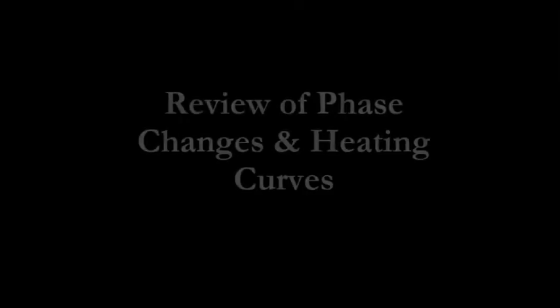We're going to look at phase changes with water once again, as we did with the heating curve of H2O lab last quarter. We looked at the range of phase changes and temperature changes that occur when you go from ice to water to steam. Here specifically, we're going to look at the phase change from ice to water and the energy associated with that. So before we get started, let's just do a recap of some ideas with energy and phase changes.